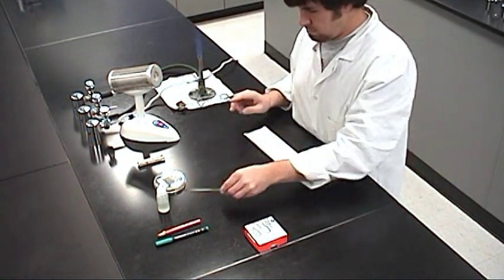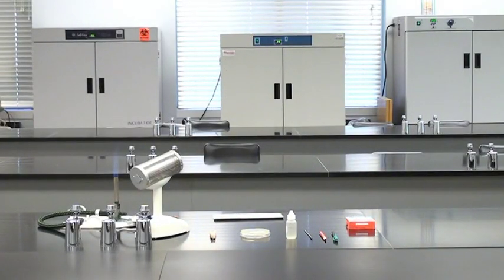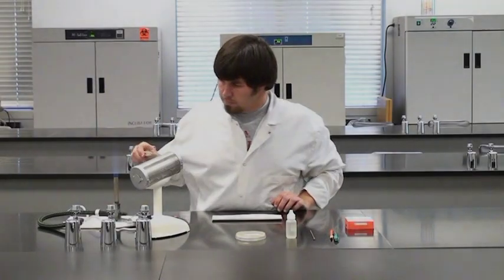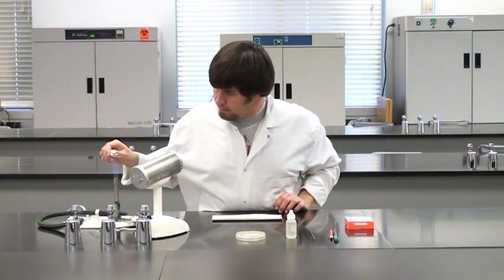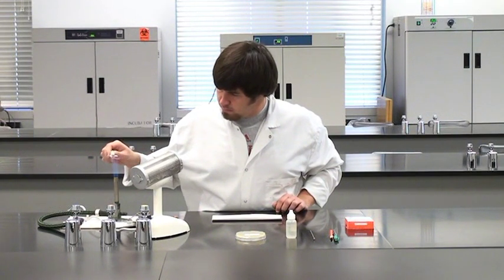Let the smear air dry completely to prevent distorting the size and shape of the bacteria during heat fixing. After the smear dries completely, it must be heat fixed. Heat fixing kills the bacteria and adheres or fixes them to the slide.